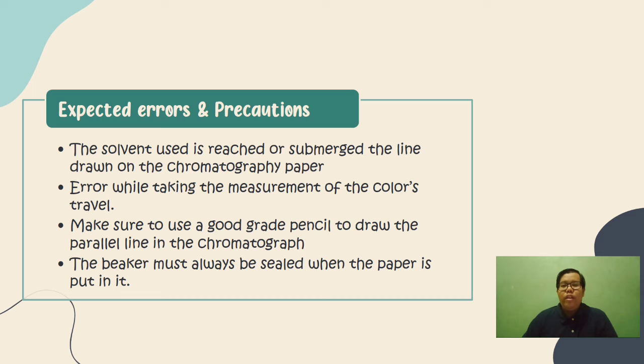We also need to keep an eye on possible precautions to be wary of while doing this experiment. First, make sure to use a good grade pencil to draw the parallel line on the chromatography paper so that the mark doesn't dissolve in the solvent. The second precaution is that the beaker must always be sealed when the paper is put in it, to prevent the solvent from drying out.